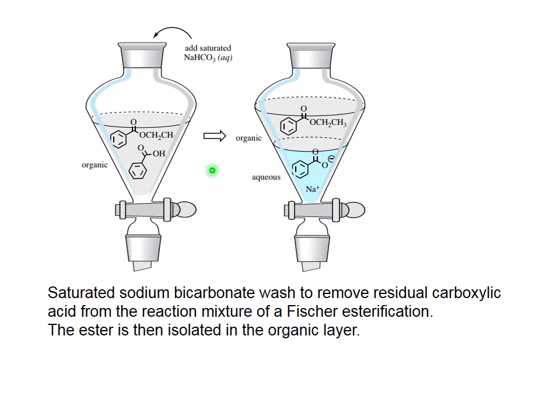The first procedure is a usual procedure for separation with organic solvent. If I have an organic mixture having several compounds, some of them neutral, some of them ionizable, we add, in this case, sodium hydrogen carbonate, a slightly basic solution, to the solution of acid.